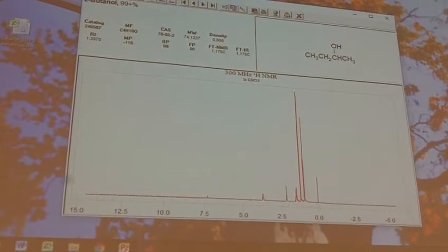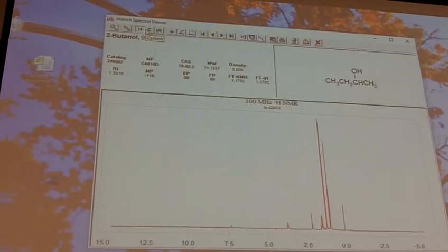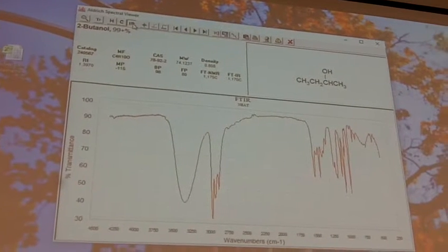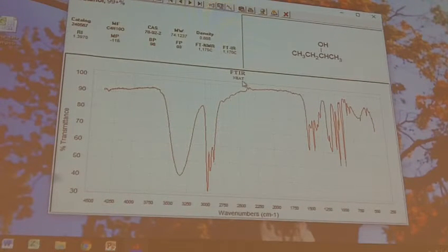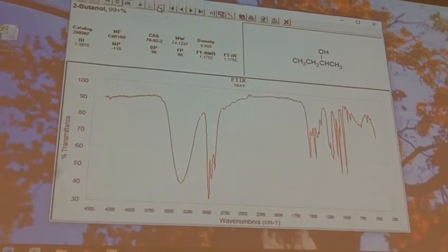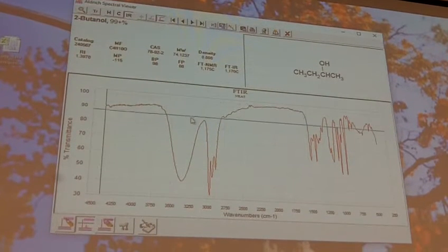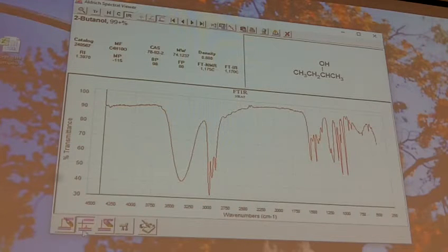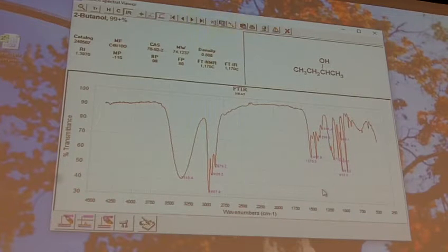Okay, butanol did. Up here, it's showing you NMR spectra as its default, which you'll use second semester. To get the IR spectrum, you just click on IR, and then you have the IR spectrum. And here it says neat, or it'll say liquid. Then to get the peaks marked, the other spectrum had a table of peaks that you would print out. Here you raise and lower the threshold: I clicked on this, and then I clicked on this threshold. You raise and lower the threshold, click on it, and then the peaks below it are marked.